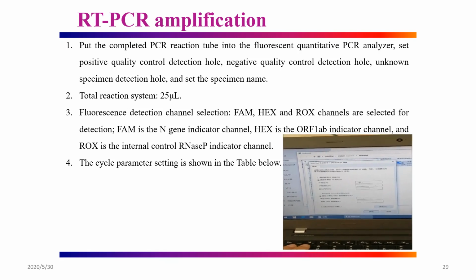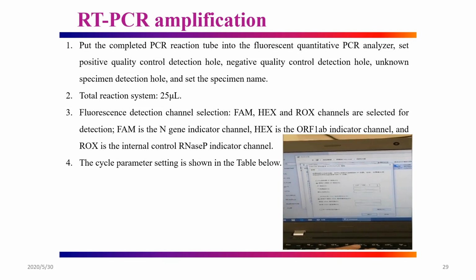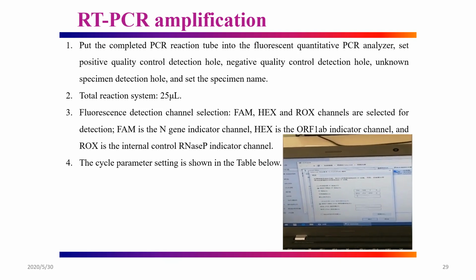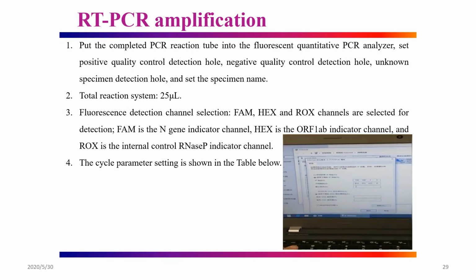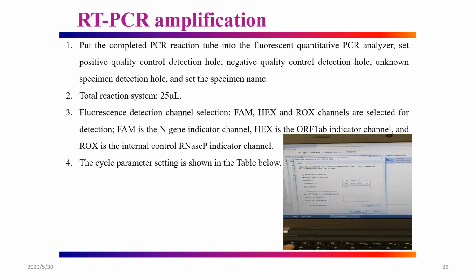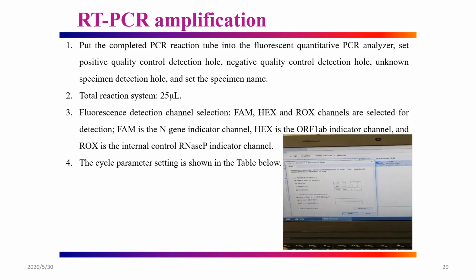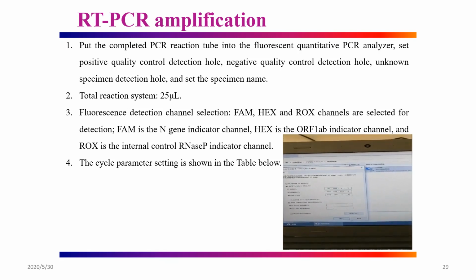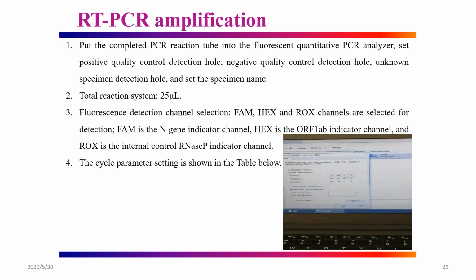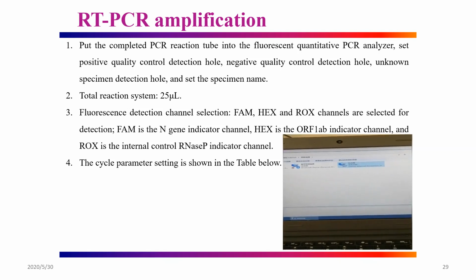And input 192.168.1.5. And the second line will be shown automatically, 192.168, the same as the first line. 1 and 1, and press OK.